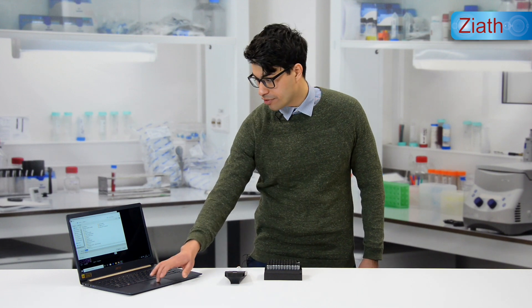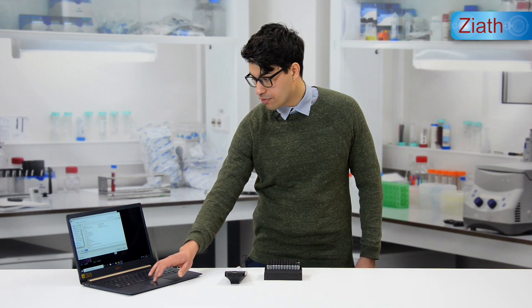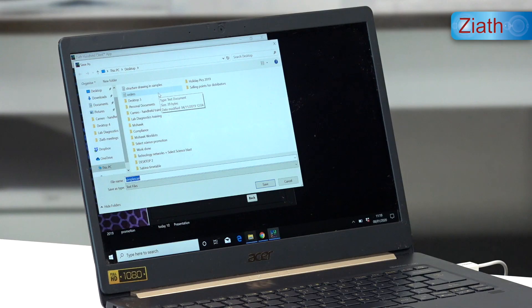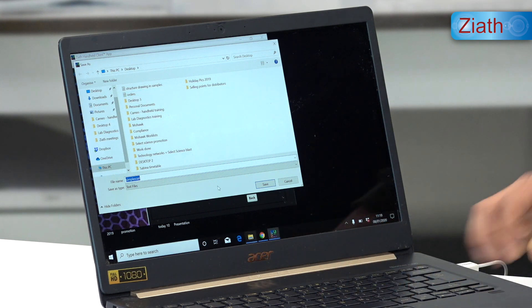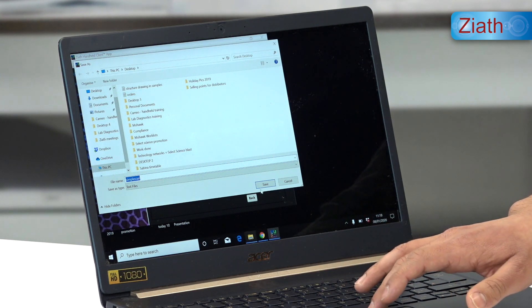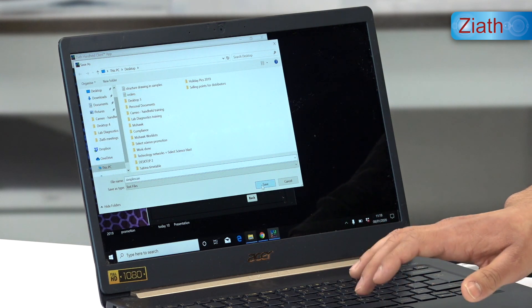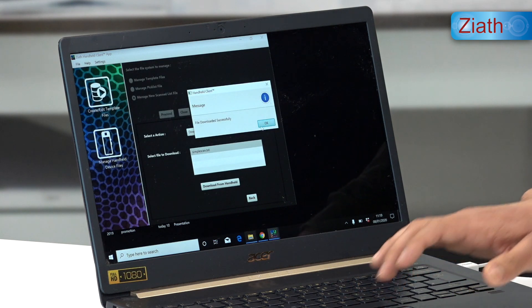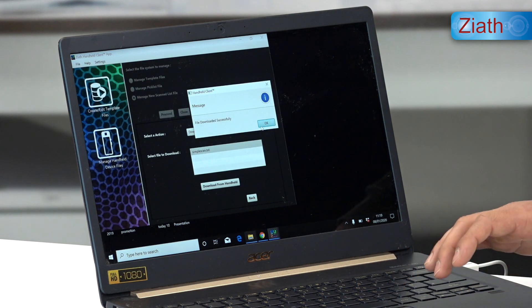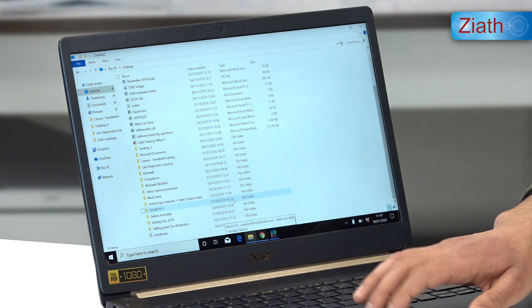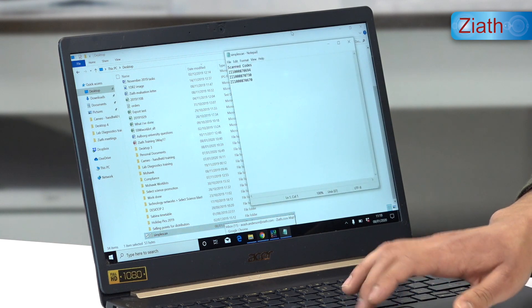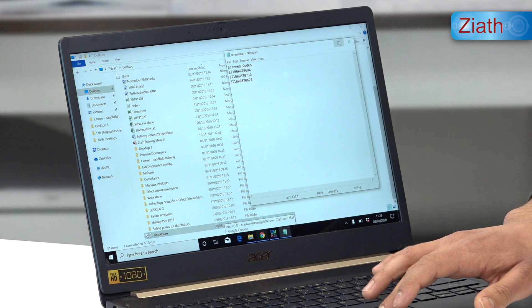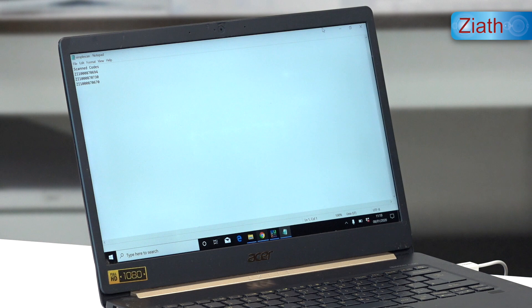We can now download this file from the handheld onto the computer, which will be saved as a text file. If I save the file to my desktop and open that file, the scan codes can be seen on screen in list format.